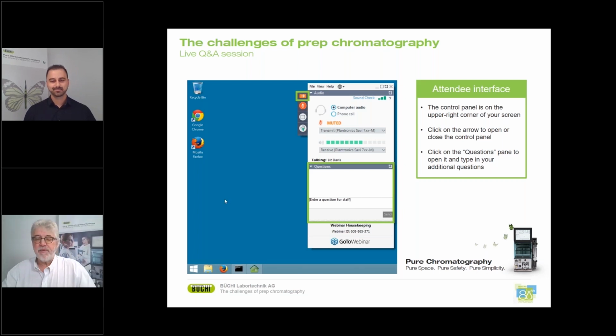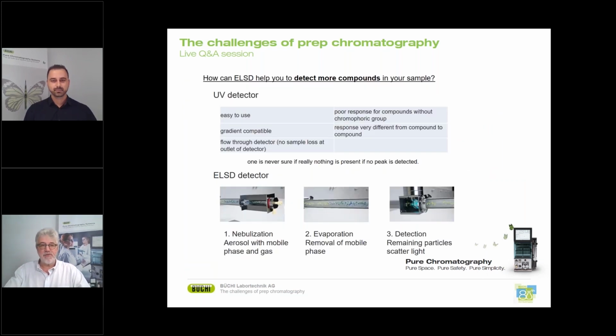Hi everybody, good afternoon or whatever time it is for you online here. In the invitation, you have seen that there were a few topics indicated already, so we will handle these first and then bring in the questions that you send us already or during this session. So the first topic that we briefly want to touch is about light scattering detection. So how can ELSD help you to detect more compounds in your sample?